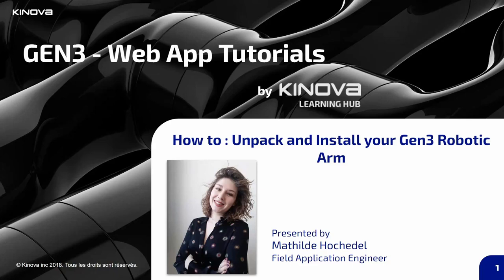Hi everybody! In this short video, we will see how to quickly unpack and set up your Gen 3 robotic arm.